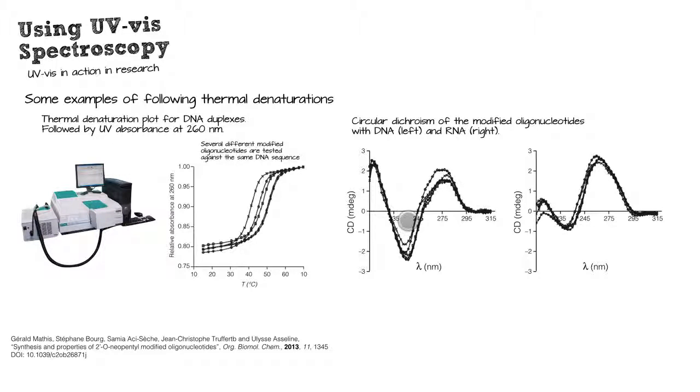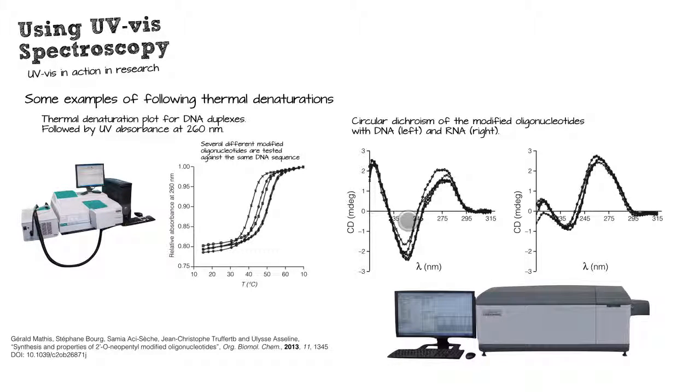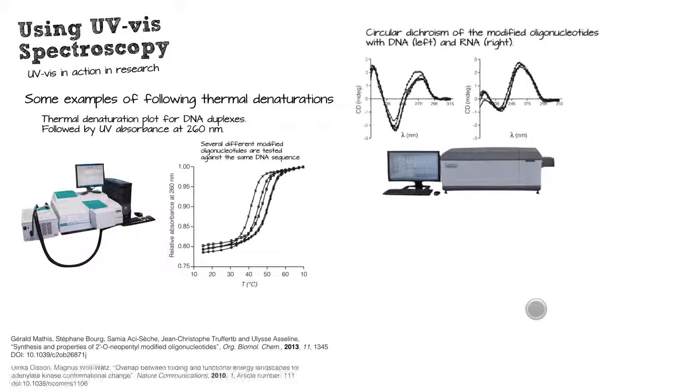And for proteins, alpha helices have a different CD spectra compared to beta sheets, so you can use CD spectra to estimate the number of beta sheets and alpha helices. And of course, if you're changing a protein, you can follow its denaturation by circular dichroism. Here is a JASCO circular dichroism spectrophotometer. They're, again, a specialized instrument, but they're common in lots of labs.